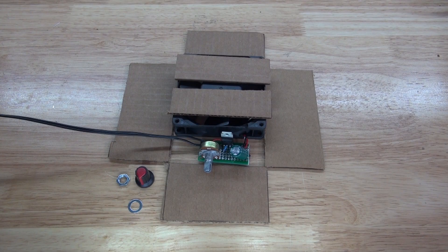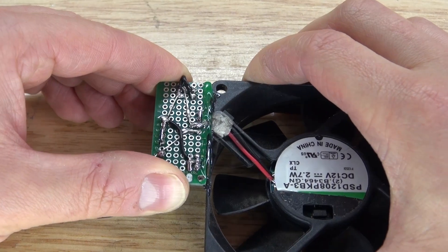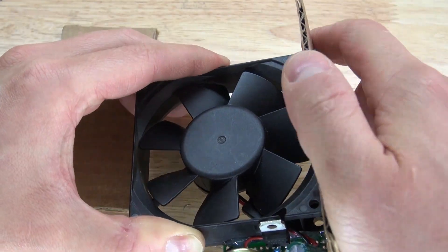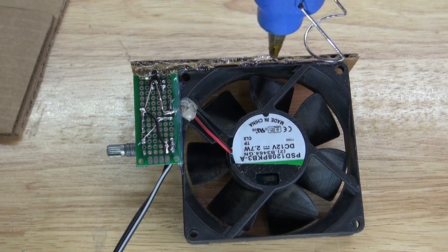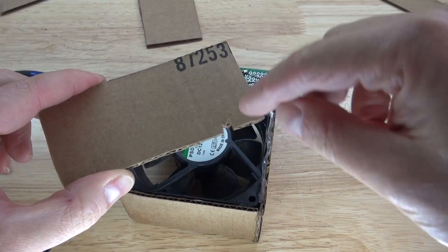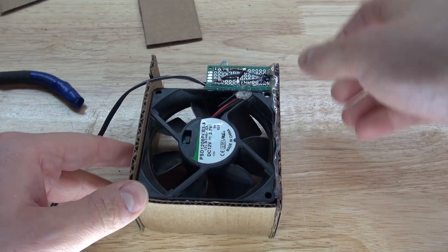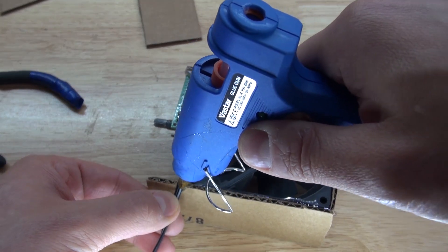Now it's time to build the housing for this circuit. I have my cardboard already pre-cut and ready to assemble. First I'm going to glue my circuit to the fan, then put some hot glue on the side of the fan and glue the side panel into place. I'm going to put some hot glue to secure the circuit to the panel, then glue the back panel in. Now I take the second side panel, cut out a little notch for the cable, place it underneath, glue the side, and it should look just like this. A little bit of hot glue for the wire so the wire doesn't come out.